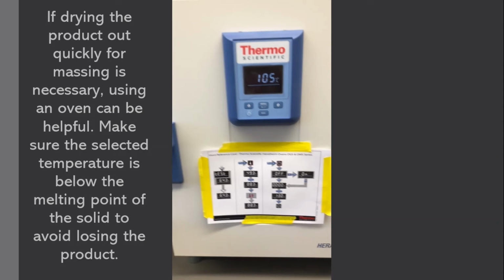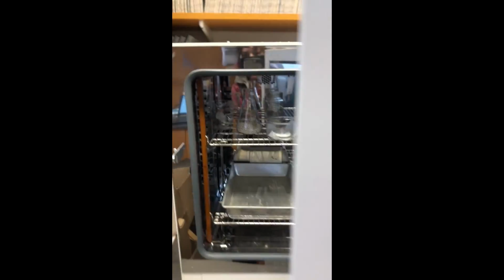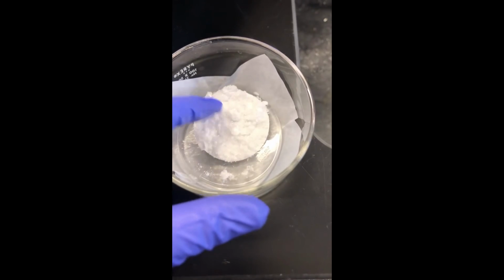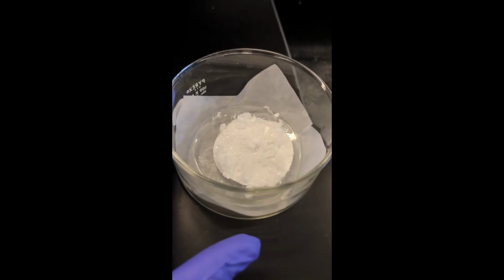So I made sure that all of the water was fully dried out of my product, and then I removed it from the oven with a heat-safe glove so I didn't burn myself on the hot glass. And then you can see here that I have a very crystalline product, and that is actually the easiest solid product to isolate through the Buchner funnel filtration.